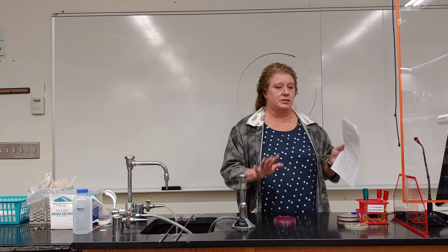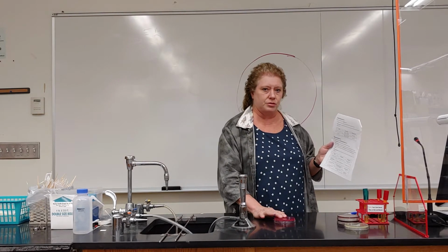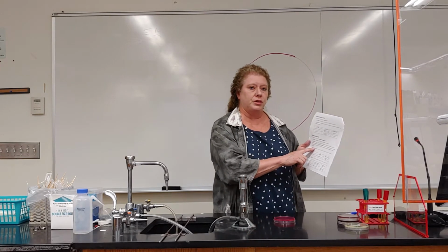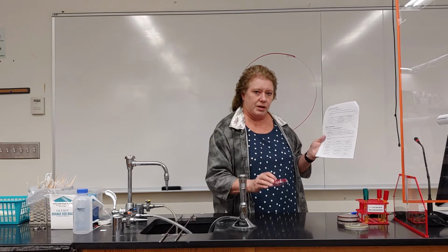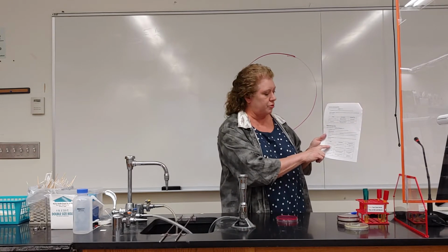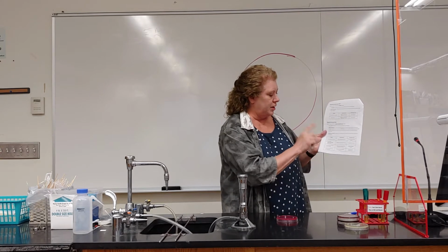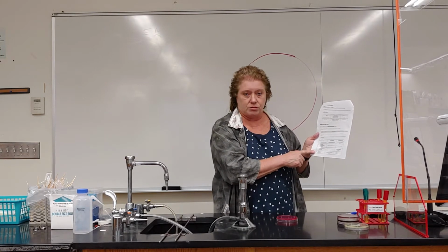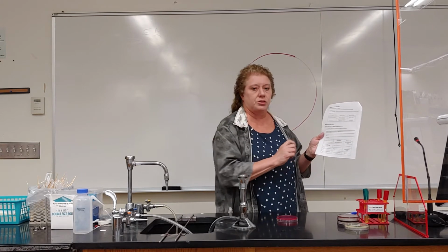Now, that's the selective part of it. But now that it grew, you can also tell the differential characteristics because this is a selective and differential media. Its differential ingredient is phenol red. This agar also has mannitol, and it is a sugar. So B was true, good growth. You can tell this row of information in B. And B also says, if this is true, it's also C or D. Those are your differential characteristics. So C says the media turned yellow around the growth.